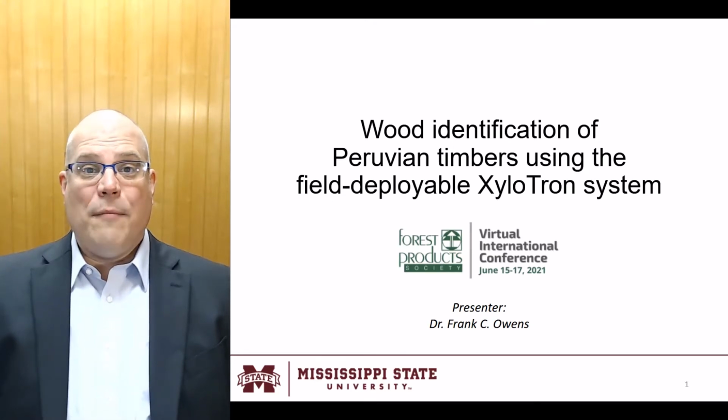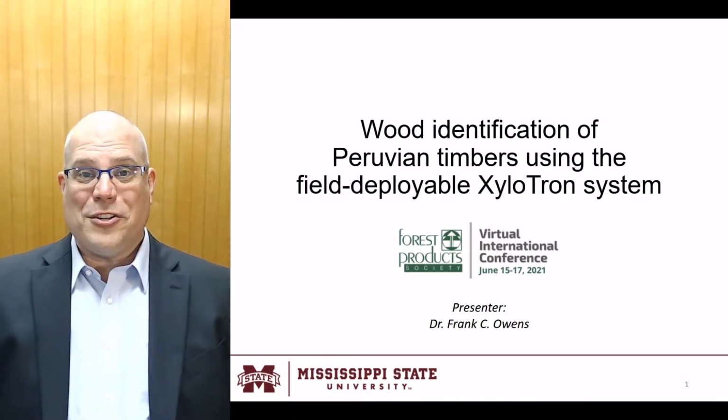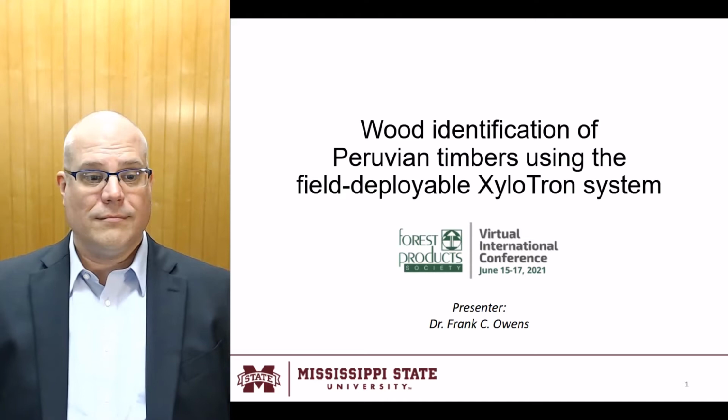Hi everyone, I'm Frank Owens from Mississippi State University. I'm here today to talk about wood identification of Peruvian timbers using the field-deployable XyloTron system. This talk is about automated wood identification using computer vision.